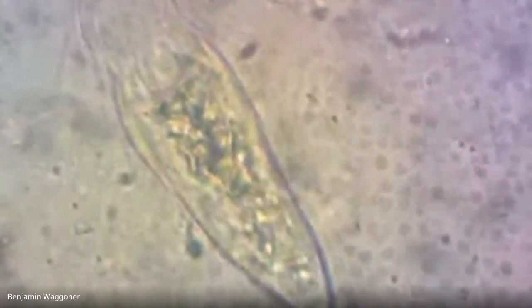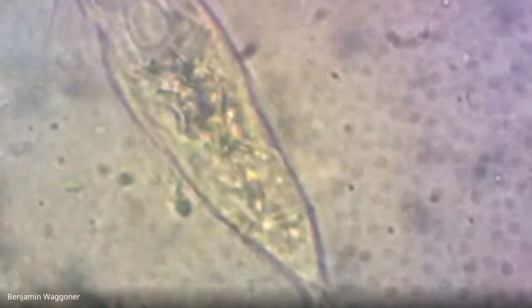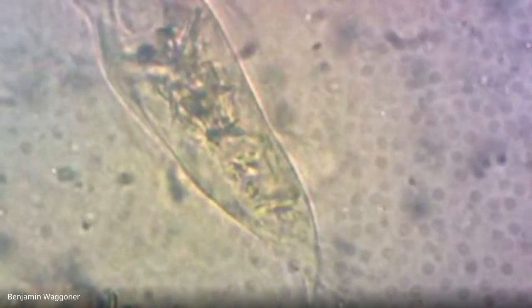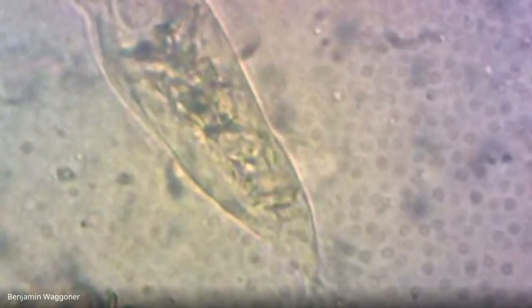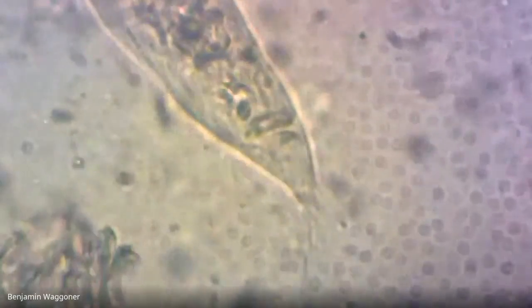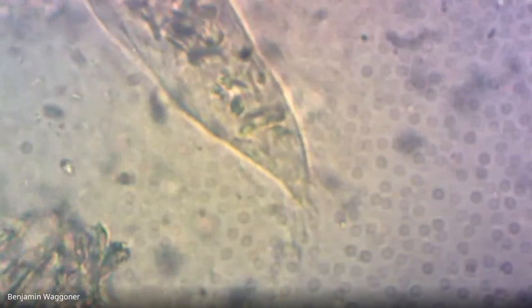And then back of that, the posterior end is kind of lump-shaped, and there's actually phagocytosed wood fragments in there. It's bacterial symbionts in the Trichonympha, in the termite, that do a lot of the work of breaking down the wood. Let me see if I can find just one more before we go.